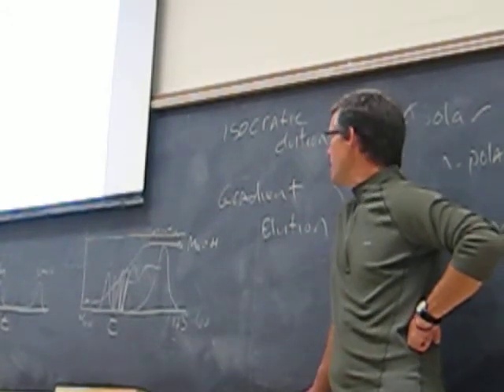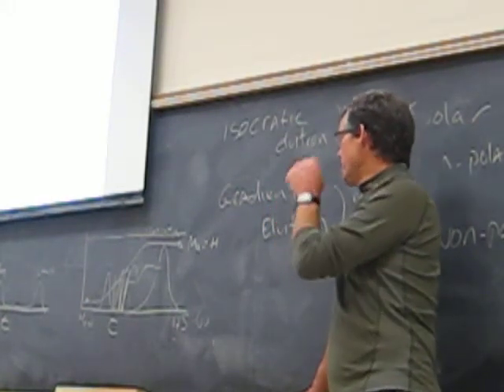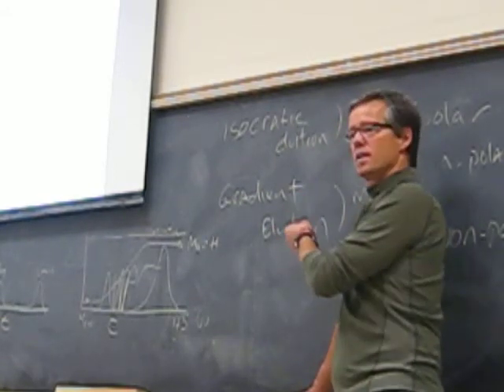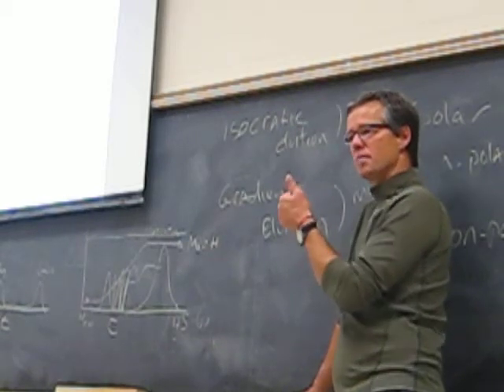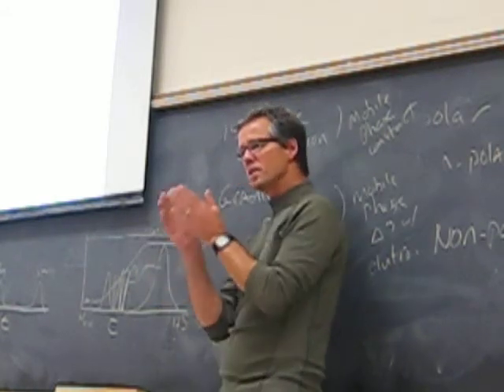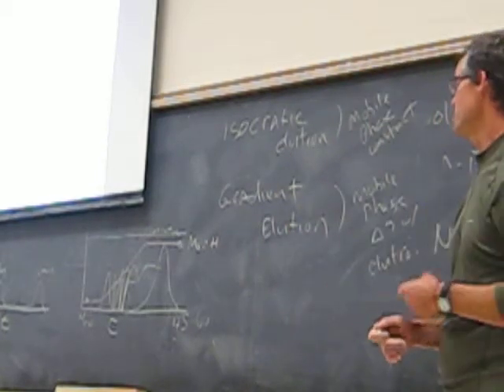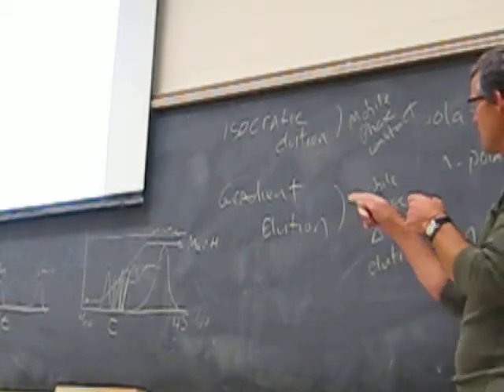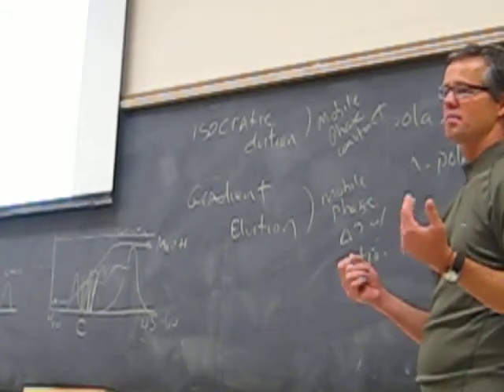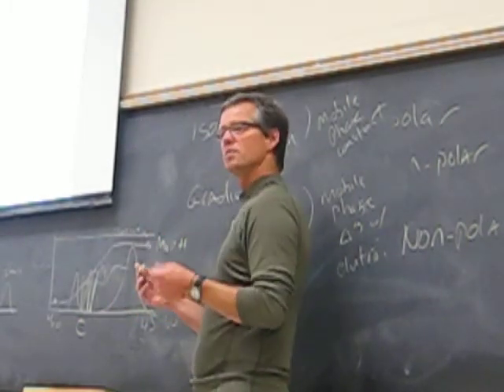We used to do a lot of HPLC of biological compounds, and the students would spend a week trying to optimize the composition of the gradient, the flow rate, all these things, to get sufficient separation in the shortest amount of time. It's kind of fun, but every iteration takes an hour. So you're like, okay, I can do this 10 times today because I'm going to work 10 hours, and I've got to do it again tomorrow. But that's what people do. That's exactly what it takes.